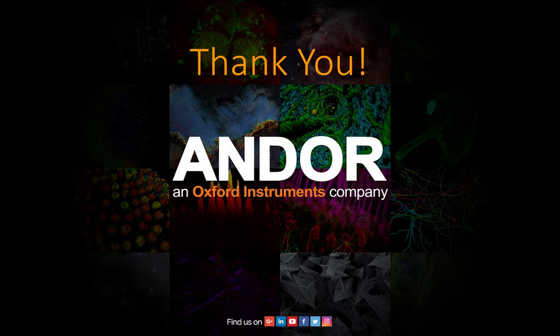Thank you. And thank you, Dr. Castillo. And we have time for one more question. Dr. Florindo, let's have you answer this question. What are the super resolution options offered by the Dragonfly? So thank you so much for this question. And I will now talk about the super resolution options offered by the Dragonfly.